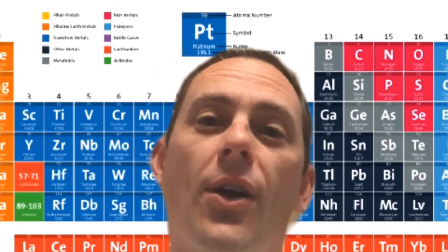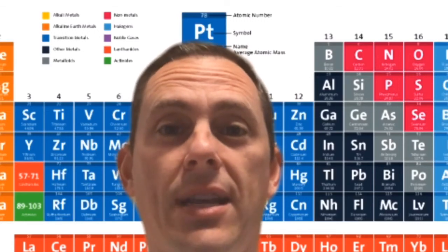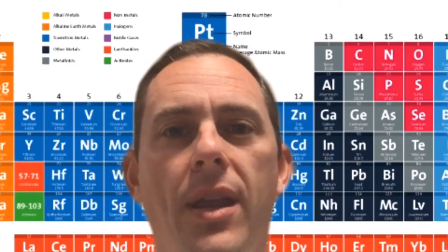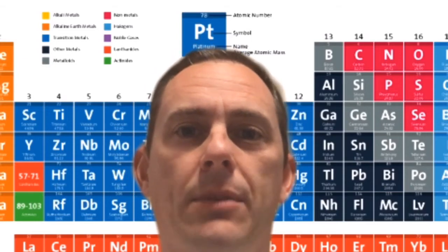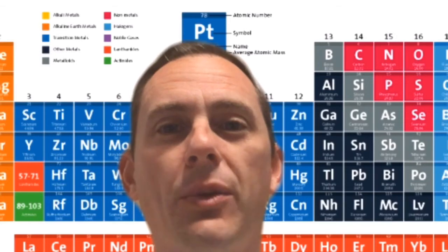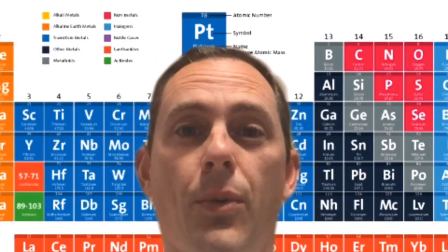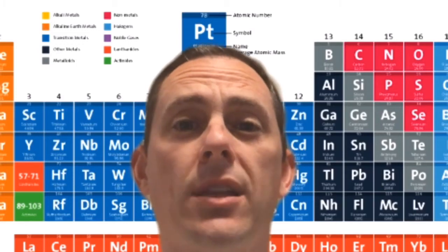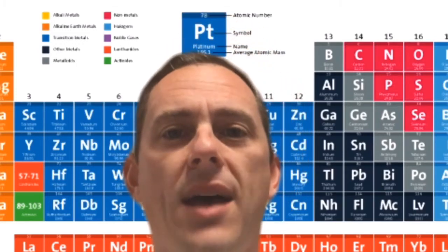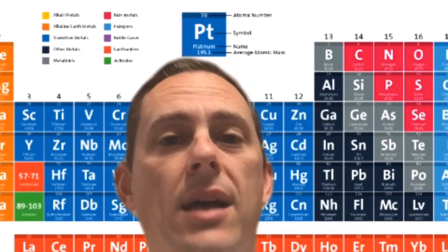Well, we are taking a look today at another instrument, and it's an instrument that we've seen before. And now that we have learned a little bit about organic molecules and about isomers, we can revisit it to see what some of its better uses are. That magical instrument is one that we saw in the beginning of the year, and it's called the mass spectrometer.